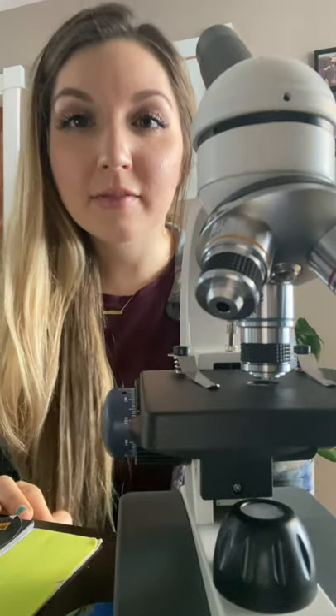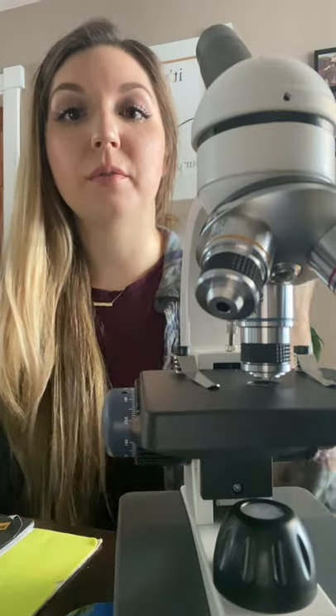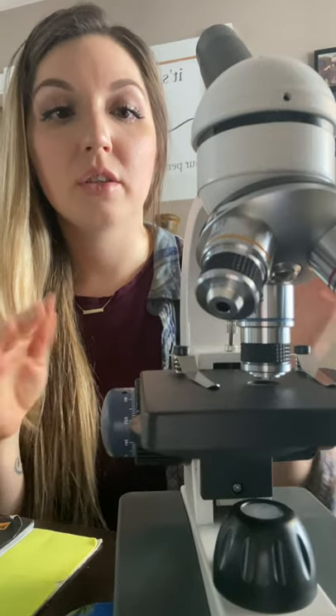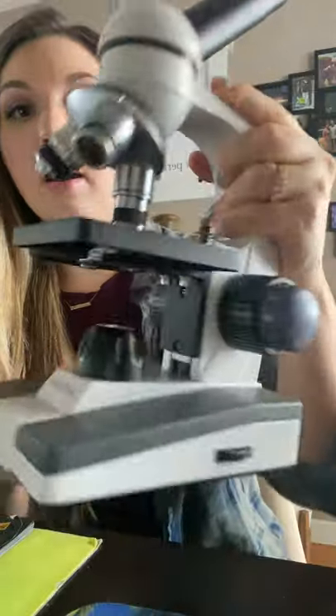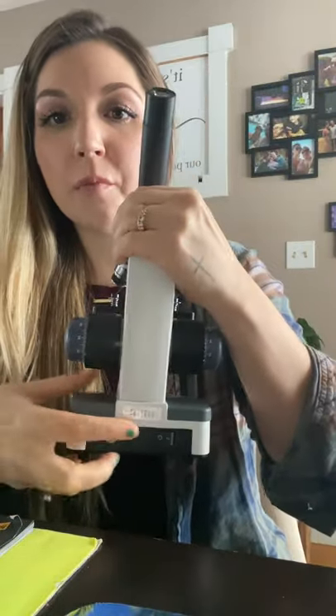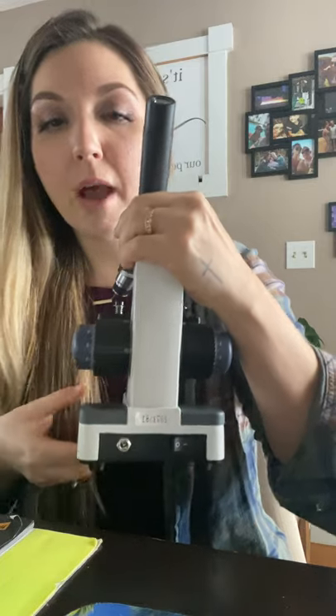Hi! In this video I'm going to show you how to use the microscope and what the different parts are. First we're going to pick it up by the arm and have one hand under the base, then flip it around and turn it on with the power switch right here.